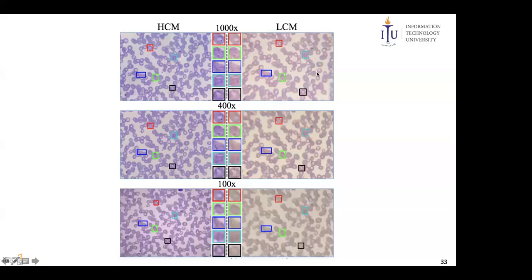So once we know the location, we go to that location and try to capture as many cells as possible, and the size of the image is smaller in this case. For the training of YOLO, because YOLO, Faster R-CNN and all these object detectors take a standard size, for pre-processing we just resize them. Otherwise the actual size is smaller than the high quality size. Okay, thank you very much.